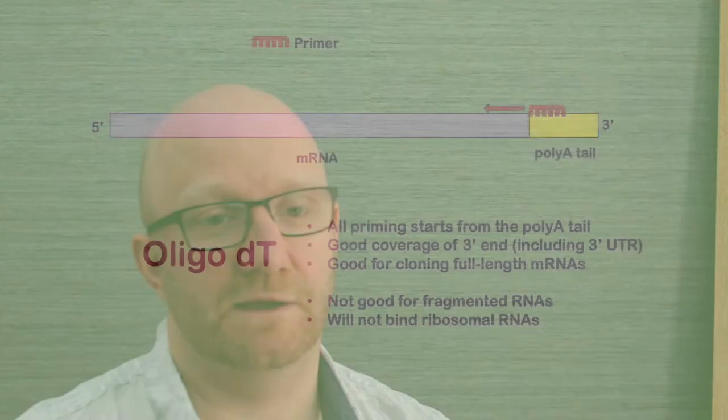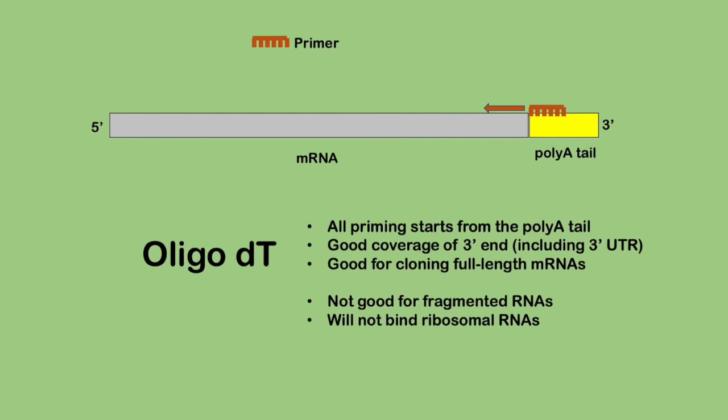The other thing that would happen with random hexamers is you won't get full-length cDNAs. And this could be relevant if you're intending, for example, to clone the gene, or if you're looking to measure the length of the 3' UTR. So that's where option 2 comes in. And that's to use oligo-dT.